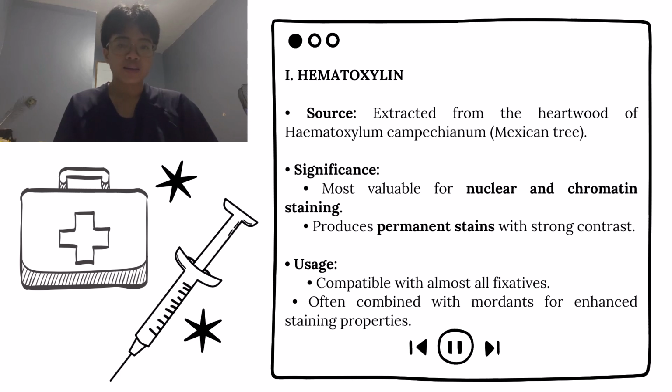Significance: highly valued for nuclear and chromatin staining. Produces permanent stains with strong contrast. Usage: works well with almost all fixatives, commonly used with mordants to enhance staining results.